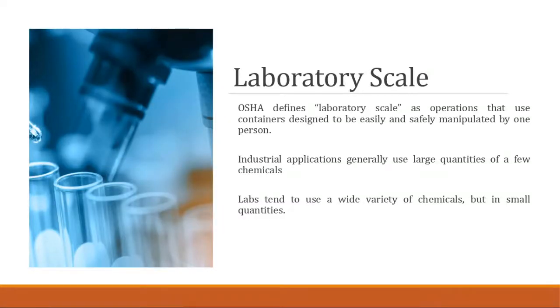So when we're looking at a laboratory scale, the way OSHA defines laboratory scale is the use of containers designed to be easily and safely manipulated by one person. What that means is if you are in an industrial application, obviously it's going to take a ton of people to move and use large quantities of just a few chemicals.